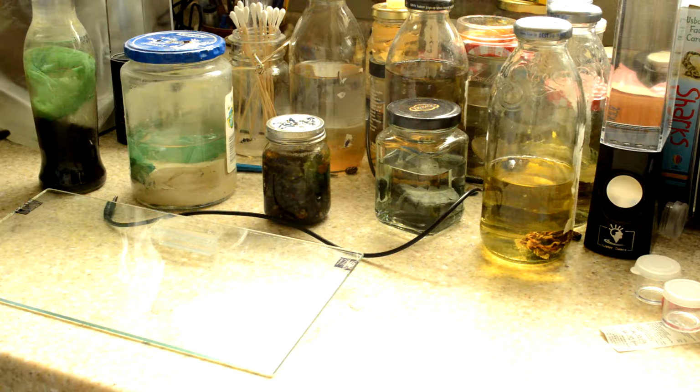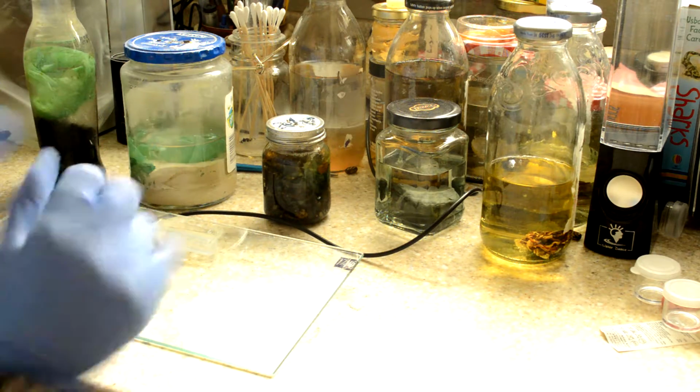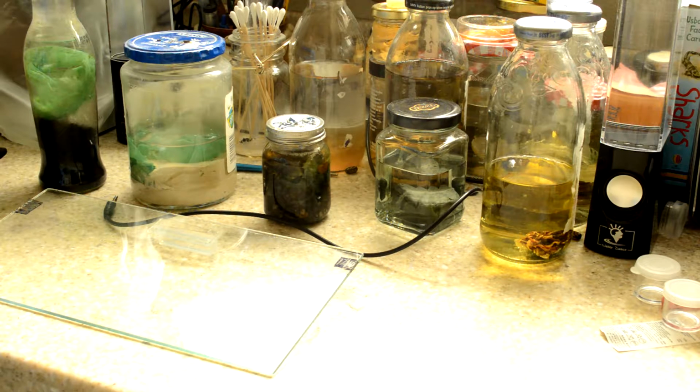I'm going to go grab some rubber gloves. I will be right back. Alright, so here we go. Now I have some rubber gloves on, and this is just a little makeshift table that I use for dissections or experiments. It's just the lid of a 2-gallon aquarium. You don't have to have that, just a smooth surface that you can clean off easily. So let's get started.